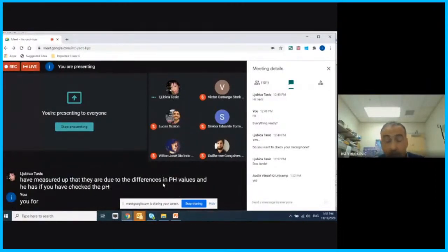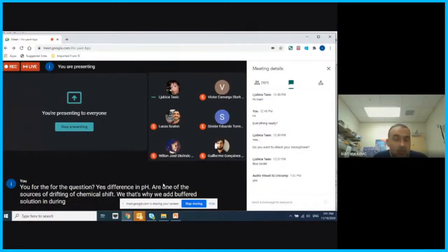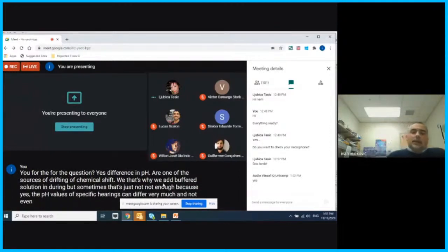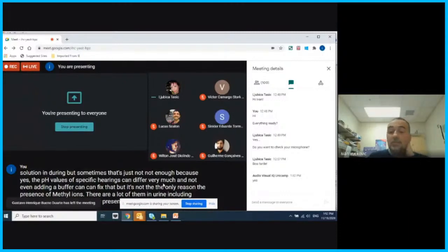Thank you for the question. Yes, differences in pH are one of the sources of drifting of chemical shift. That's why we add buffer solution to urine, but sometimes that's just not enough, because the pH values of specific urines can differ very much, and not even adding a buffer can fix that. But it's not the only reason. The presence of metal ions, there are a lot of them in urine, including magnesium and calcium, can also induce a lot of drifting in chemical shift.